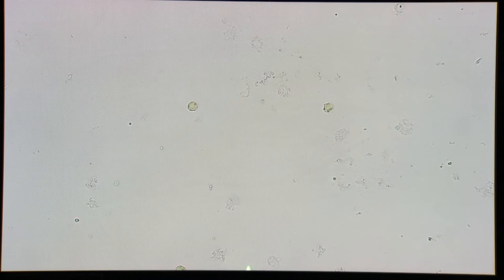After you've looked on 10 power at both stained and unstained, you go up to 40 dry, which is considered high power. This is where you count cells and estimate crystals, debris, fat, etc.